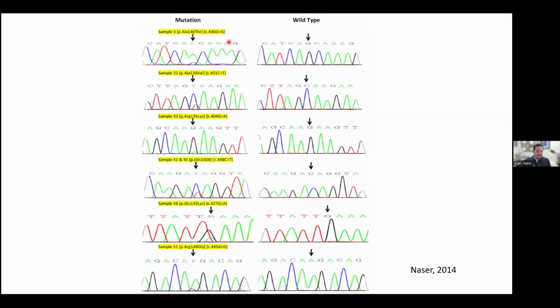and that corresponds to KRAS A146T. In our next example, we're looking at codon amino acid 134, and we have a change from a C, again blue, to a T, red. And again, this is heterozygous. In a proto-oncogene, we expect heterozygous changes in the absence of copy number changes. Here we again, instead of a G, we have an A, a small little green bump.